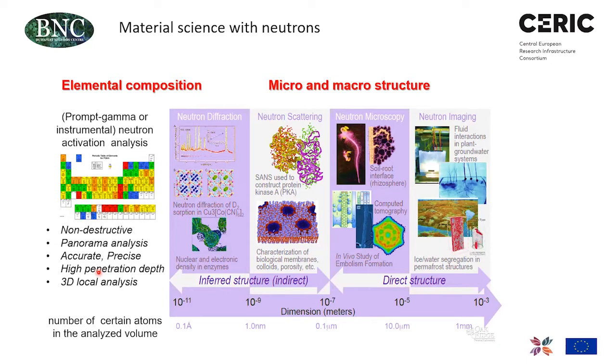of the sample. Most other analytical methods like X-ray fluorescence or PIXE are surface analytical techniques, so they can penetrate the material only to a few microns or tens of microns. And in non-homogeneous or layered samples, this sampling volume is not representative of the composition of the entire sample. In this case, nuclear techniques have advantages.